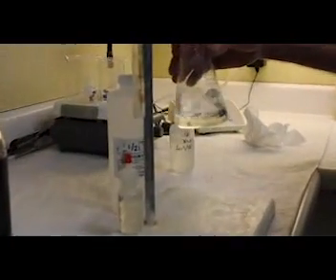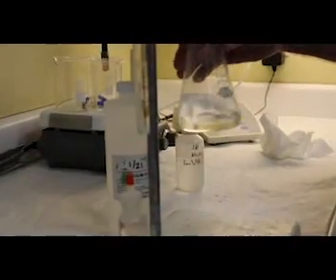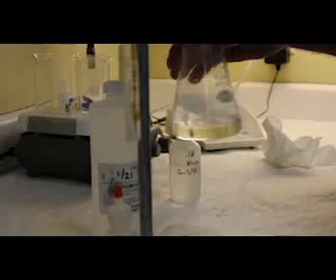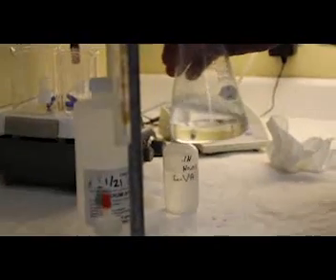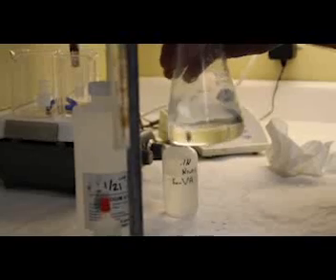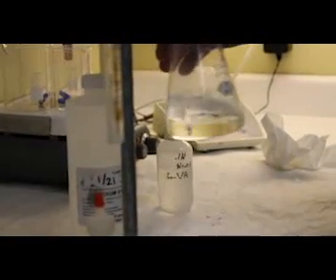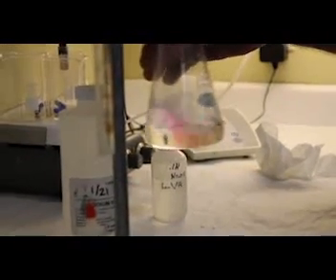As you see the drops starting, I'm slowly getting to the point where they'll start dropping. You'll see a little bit of red show up. So here we go. Okay, there's the first drop, second drop. Now when this stays red and stays solidly red, we know we're at our endpoint.